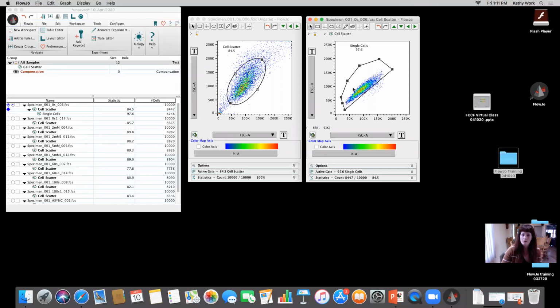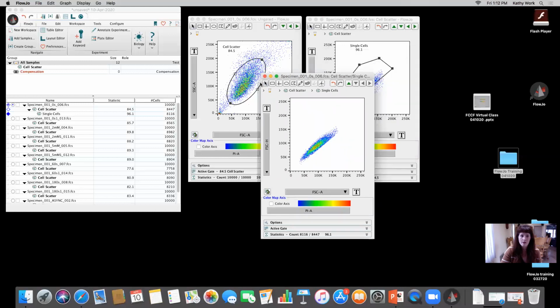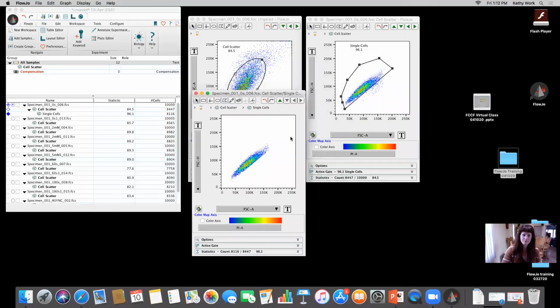The strongest recommendation I would make is to explore all of those, because sometimes you'll see it pulls out a little bit better in certain parameters than others, per cell type or per experiment. So don't think that just because you have one favorite that it's going to apply to all. Just dropping those little hints in for everyone as we go along.